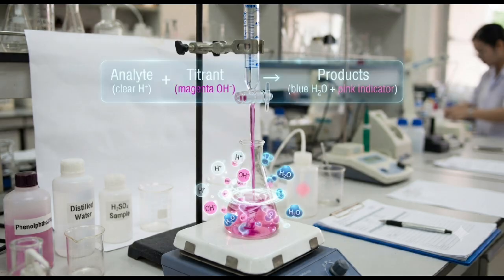Basic principle. The basic principle is based on a chemical reaction between the analyte and titrant. At the equivalence point, the reacting substances are present in their stoichiometric proportion. In practical analysis, we detect this point using an indicator or an instrumental technique.